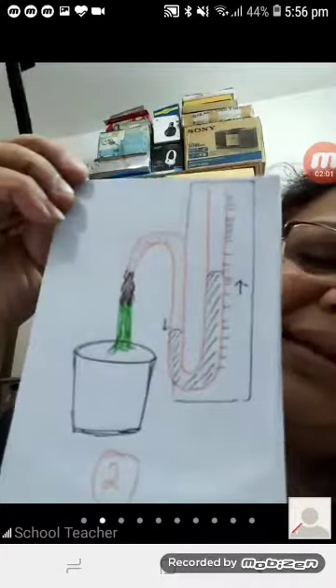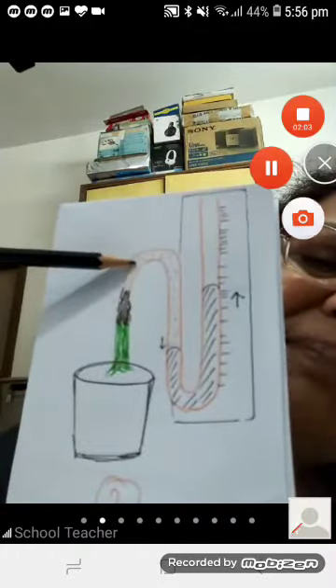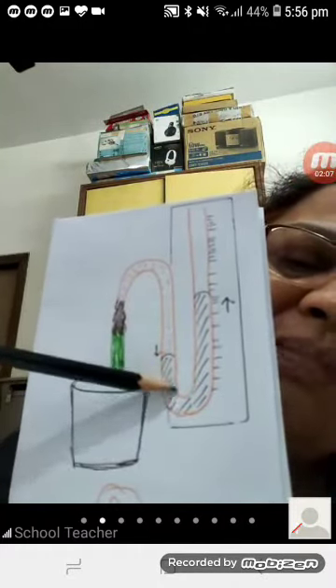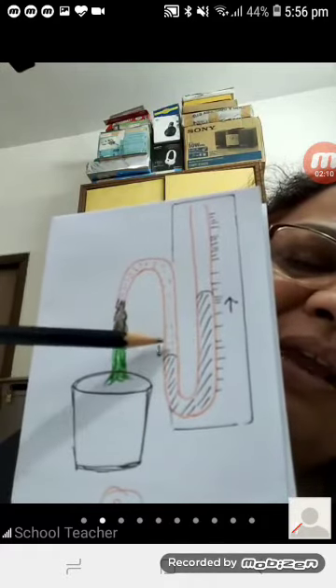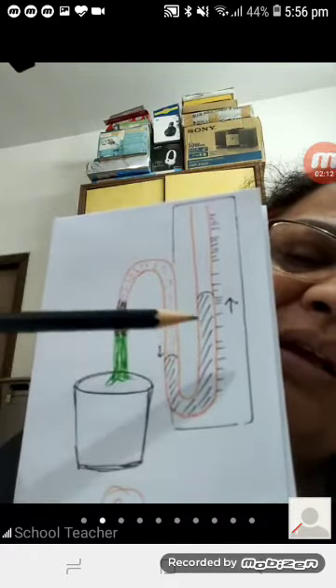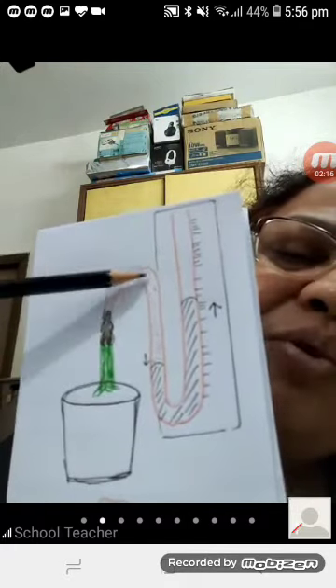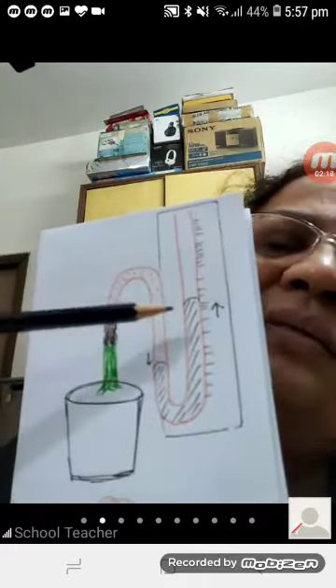You can see that cell sap has come out and pushed the mercury of the manometer — it goes down on one side and comes up on the other. This shows that root pressure exists in the plant.